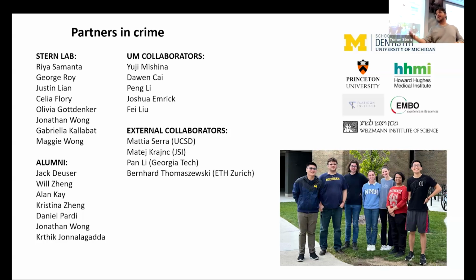I was asked quite a lot, you have U-Nets, why are you using watershed? Because it worked the best. I don't feel any strong emotions toward new technology. Now Ria is spending her postdoc on trying to recover the full cellular tree of the fly to get to hundreds of time points with maybe 99% success. And she's of course using deep learning networks. If you want something so challenging, you need to move on to deep approaches. But for this one, it just worked best.